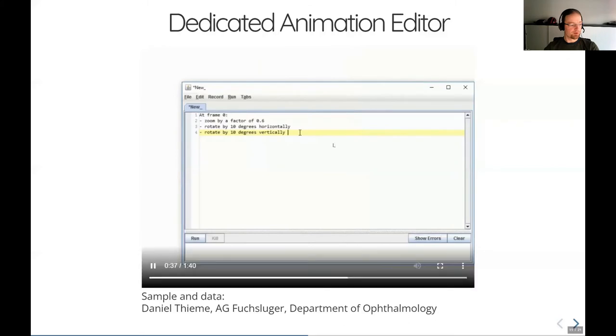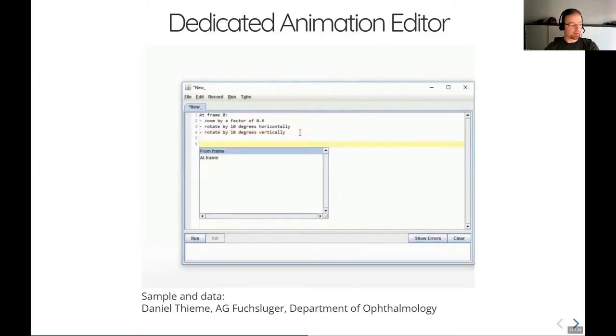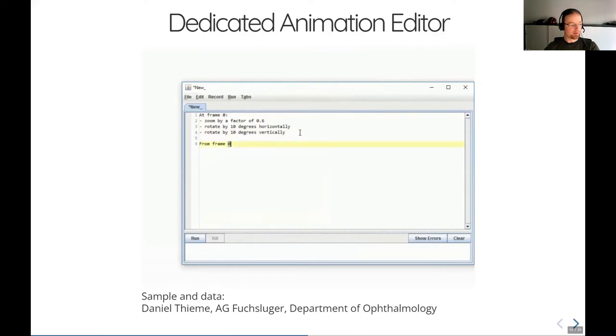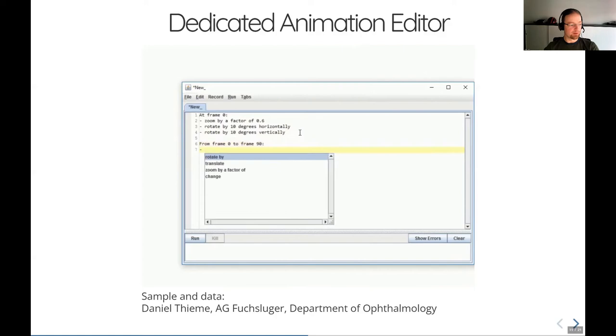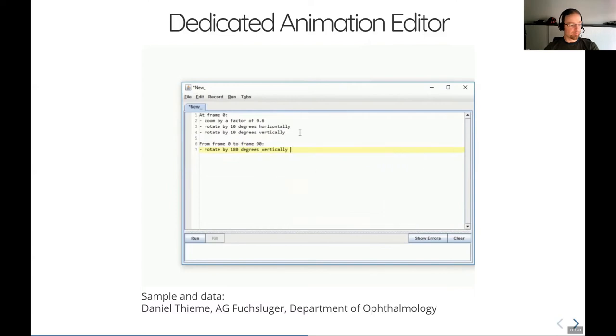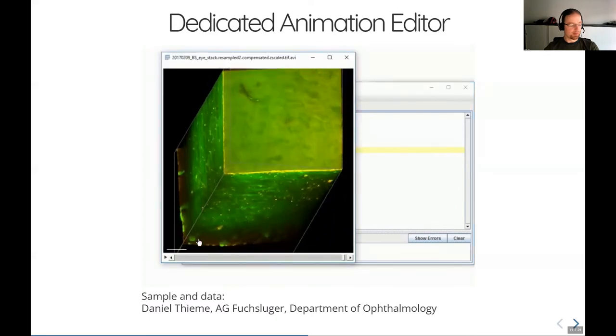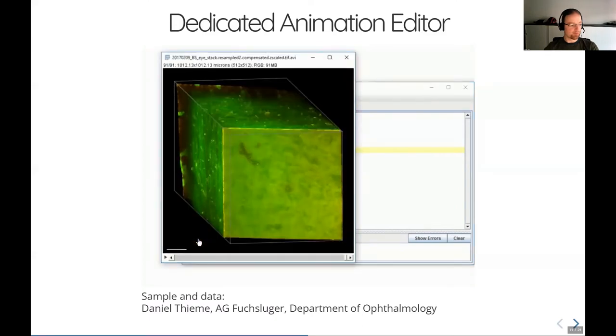So you see I rotated now the sample a little bit in each direction. Now I say from frame 0 to frame 90, so within 90 frames, I want to rotate this sample by half a rotation. Whenever I want to see what comes out, I click on run to just get a quick preview, and then I can continue from that.